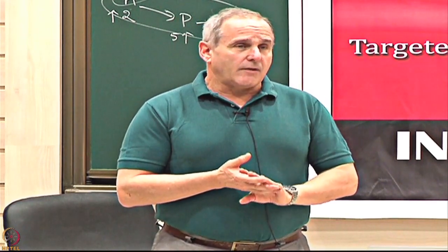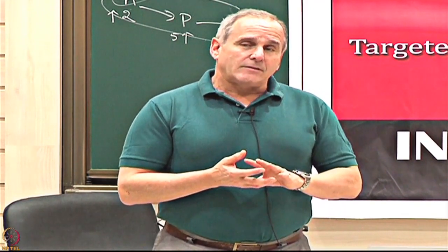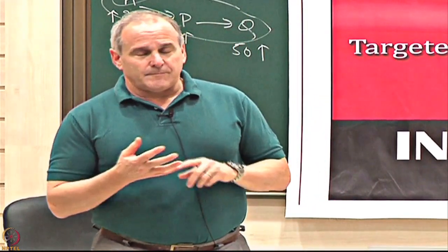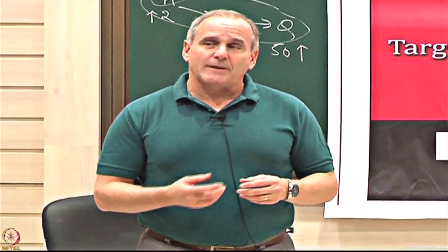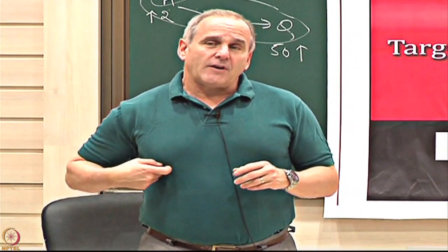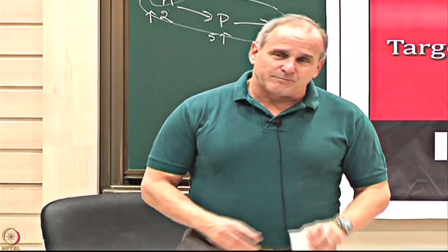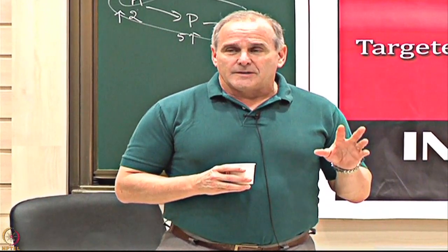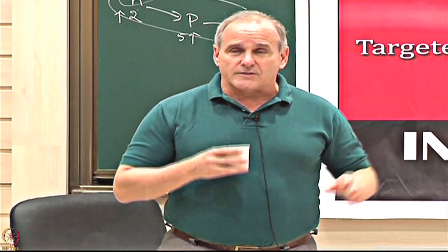There were 2 or 3 others that had been proposed but not verified. The methodologies that people had used, they had tried doing pull-down experiments, mass spectrometry experiments, and various chemical linkage experiments, but it was very hard to figure out what the targets were. So we had a very ambitious postdoc in the lab, Xiaobo Yu, and he wanted to see if he could use the protein array as a way of discovering what the targets of these enzymes were.